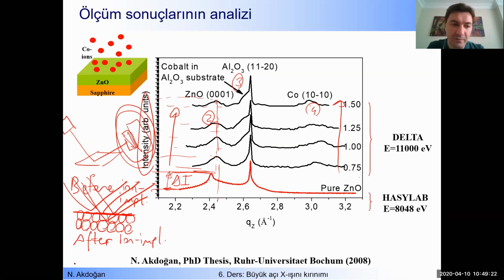what happens? I have this type of surface. So what do you see here? Also within the material, everything is destroyed. Okay, so here you have a perfect surface before the implantation, but after the implantation, you don't. So incoming X-rays cannot go to the detector. Only a very small portion of them can go to the detector since the material is destroyed. It is behaving like a destroyed mirror. Is it clear?